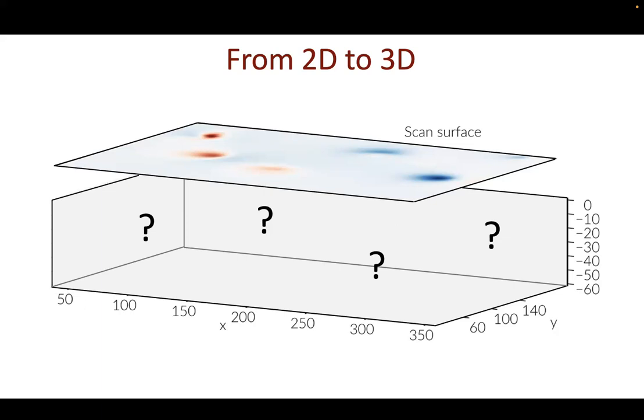So what we did is we took our sample and we put it in a micro-CT, because the good thing about iron oxides is that their density is approximately twice as high compared to the other minerals that are prominent in the volcanic rock.